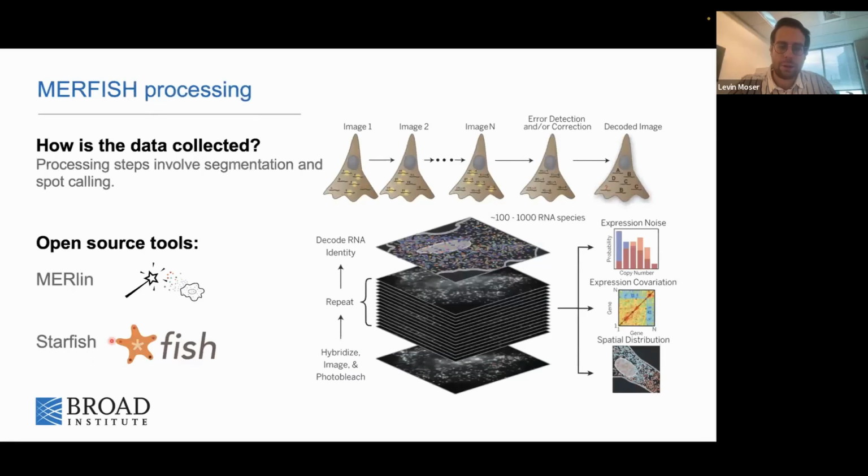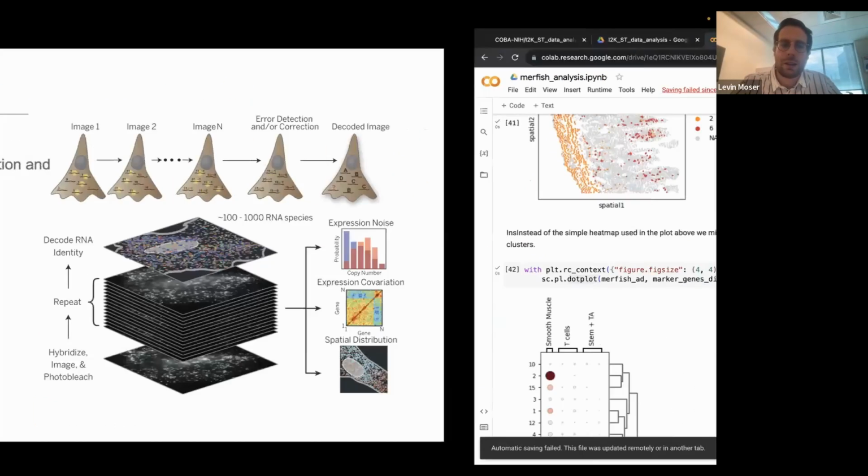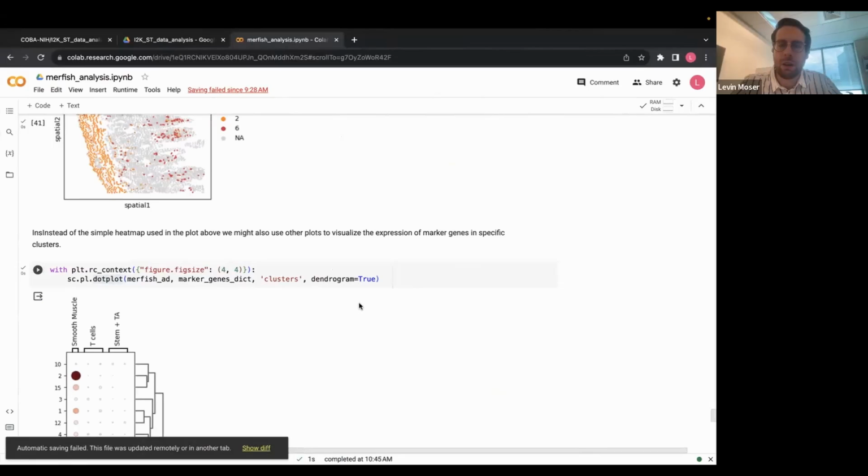Maybe have a look at Starfish. I think Starfish used to be the most sophisticated one that supported a bunch of different protocols. However, it's not maintained anymore since maybe 2 years. So if it's a newer protocol, I doubt that it will be supported.